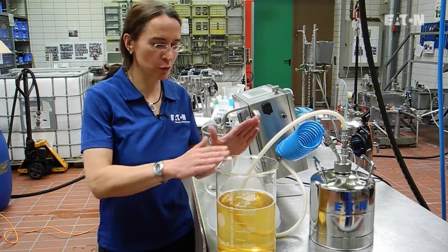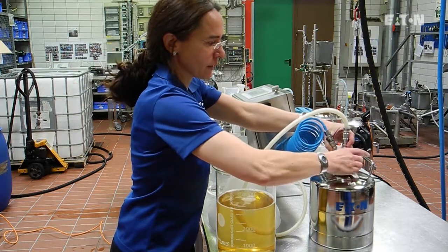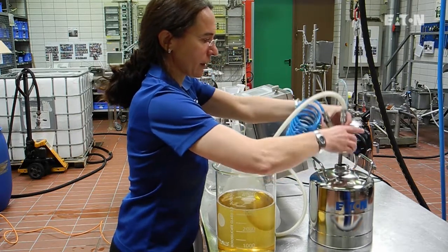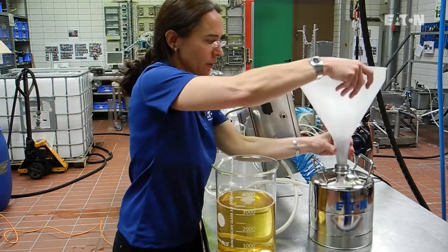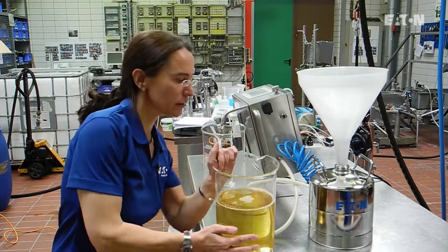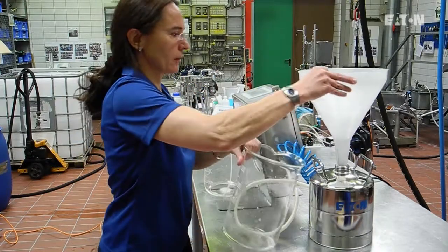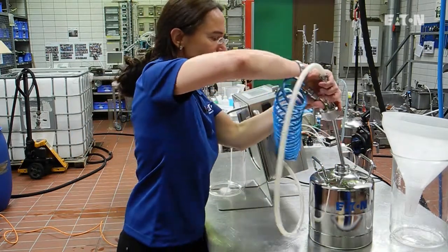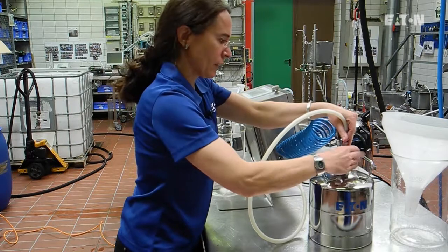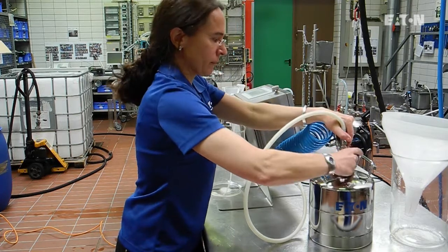We will start now with a trial. We take 3.3 liters of wine, we open our storage tank, then we take a filter, put it on, and we pour in the wine into the storage tank. And then we can easily close again the whole equipment.